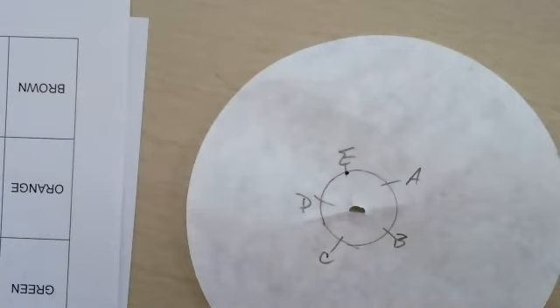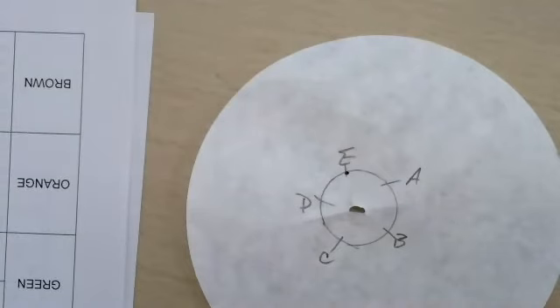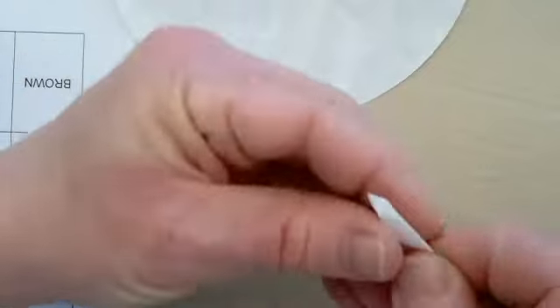Next, you will, again, eye up where the center is and take this pencil, or your pencil, and we're just going to poke a hole in the center. Also at the station are pieces of that circular filter paper that have been cut. I think it's best if you take this kind of pie piece, fold it, and then we are going to insert that through the filter paper. This will act as a wick.